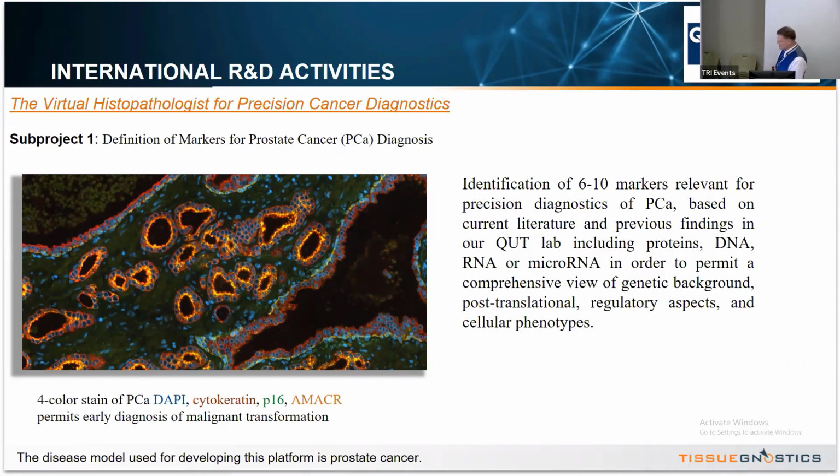Also, we have a collaborator at the Department of Dermatology in Erlangen, Germany, who uses the MELK technology, multi-epitope ligand cartography, where they demonstrated up to 200 markers sequentially stained on the same sample, always using FITC and PE, two fluorochromes, which can be quite nicely bleached.